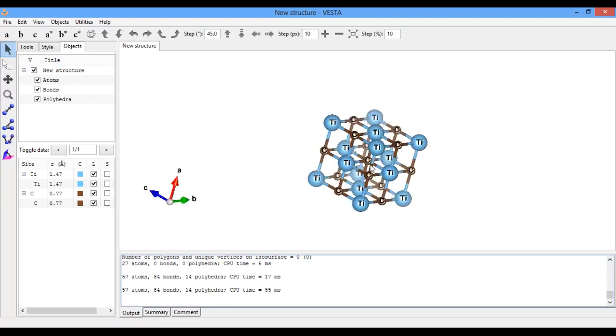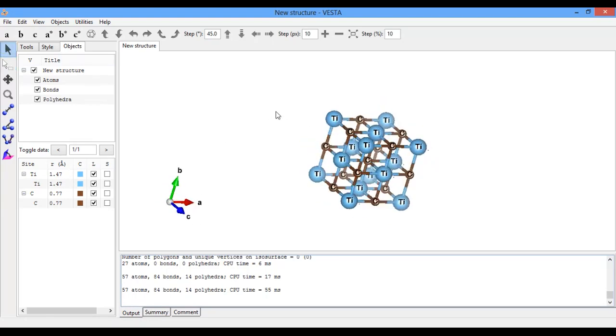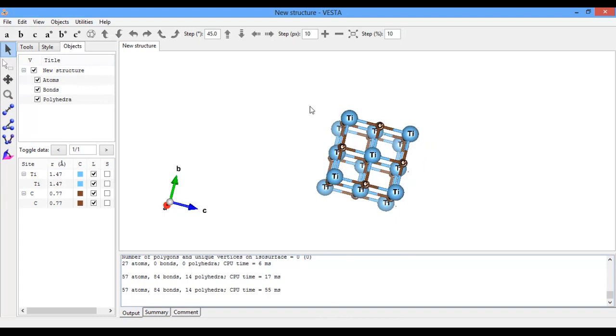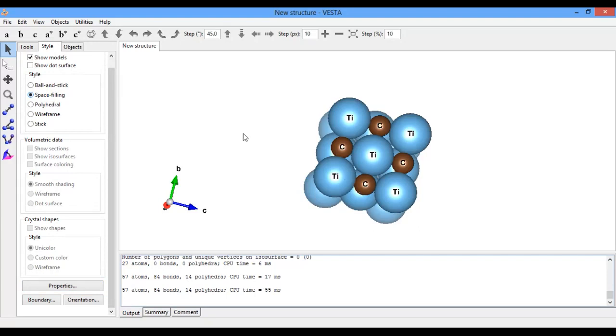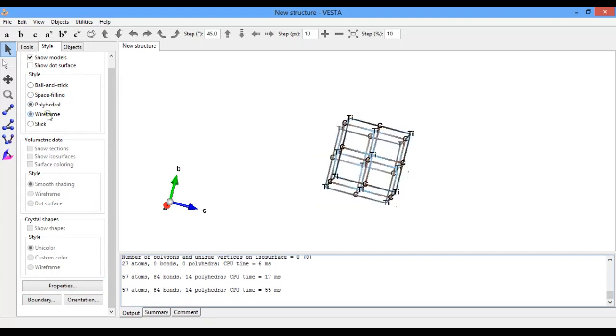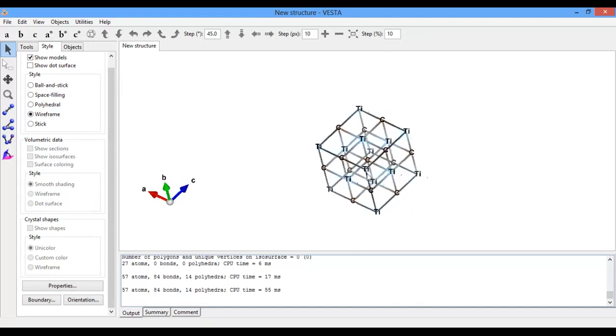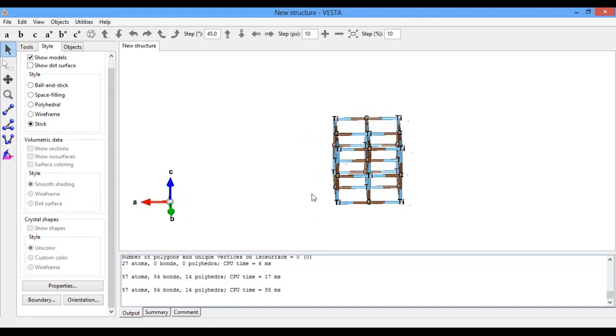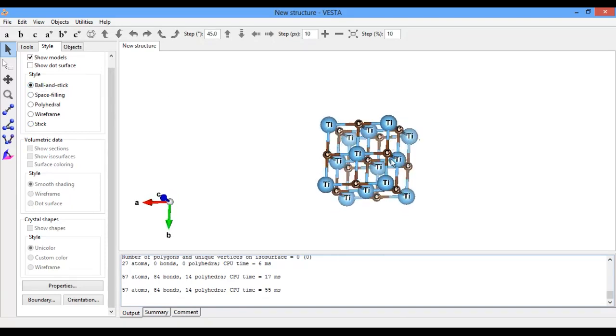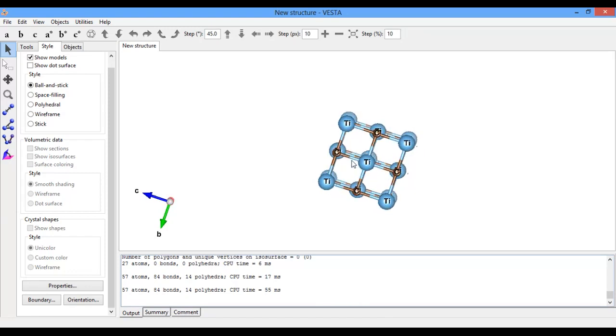Here you see the crystal structure of titanium carbide. For style, you want space fill, or polyhedral, or wire frame - these are different styles in which you want to see your material. I think ball and stick is the best for visualization.